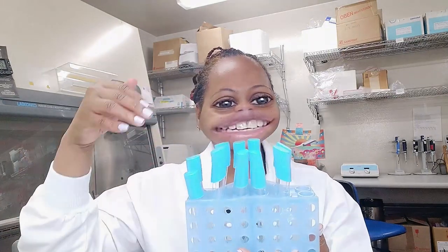And I know it as serial dilution and plating. So because I'm not doing wastewater or maybe milk products. If I was doing soil, if I wanted to know how many bacteria will grow or can grow based on the conditions or what I'm growing them on, or in say a gram of soil, I would do serial dilution. So you will see why it is called serial dilution.